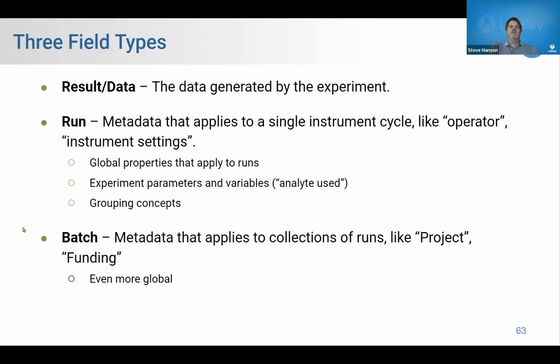So all specialty assays are just a table type, but they're a pretty complex table type. There are 3 kinds of fields to an assay design. I think of it as a chandelier of fields. At the bottom of the chandelier, there's the results data. And then there are 2 super levels above those, for global properties. There's run properties, run fields, and those are more global fields.